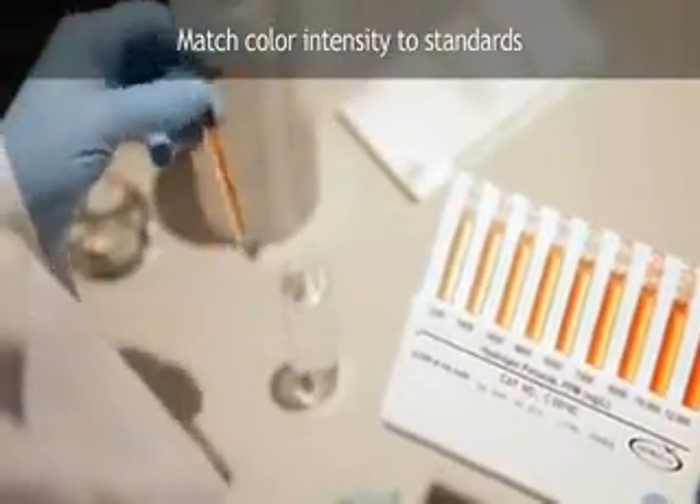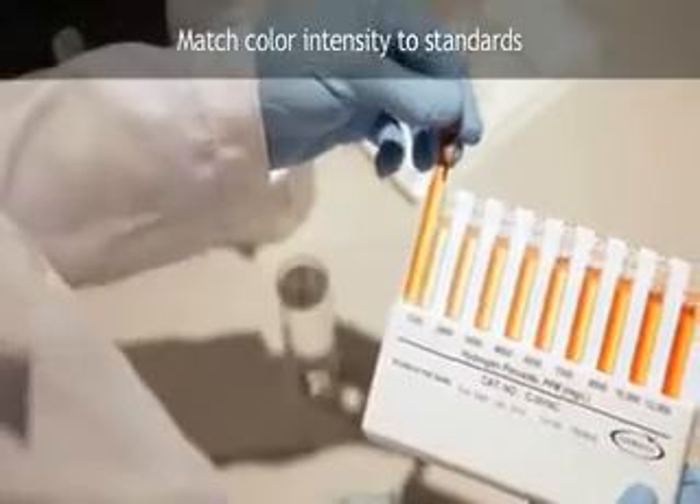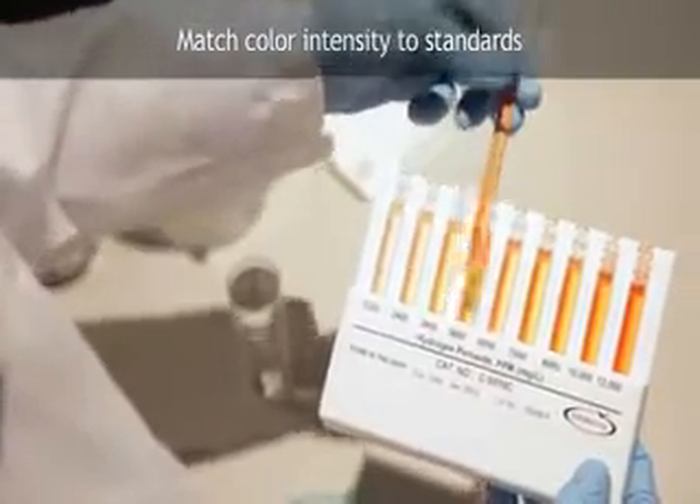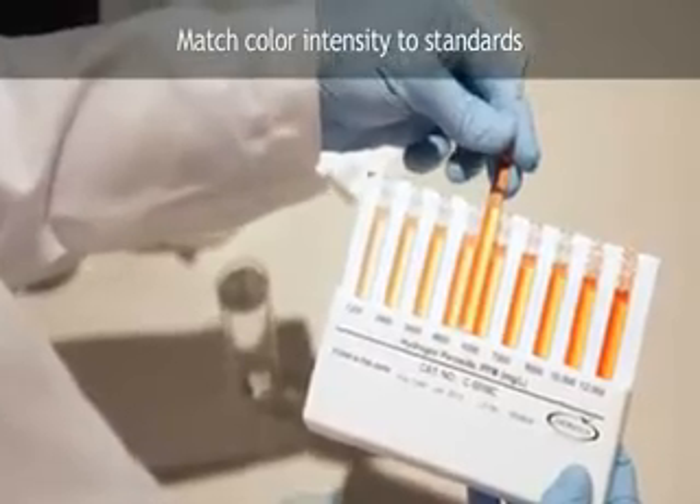For higher concentrations, hold the flat comparator in a nearly horizontal position while standing directly beneath a source of light. Place the ampule between the color standards, moving it along the comparator until the best color match is found.